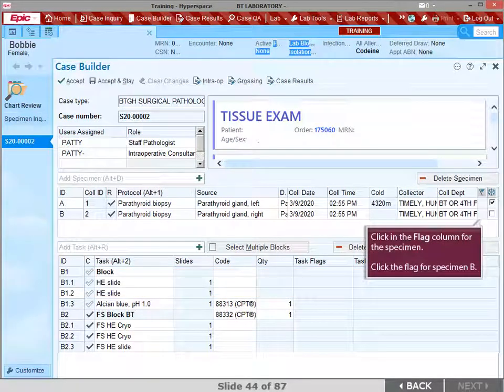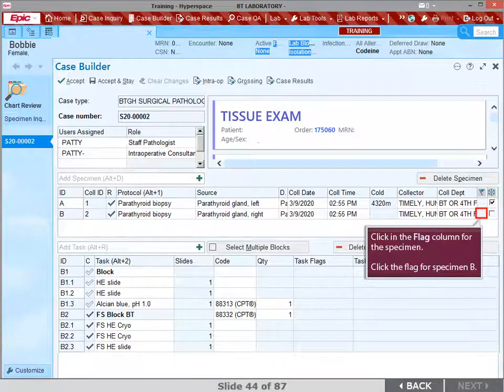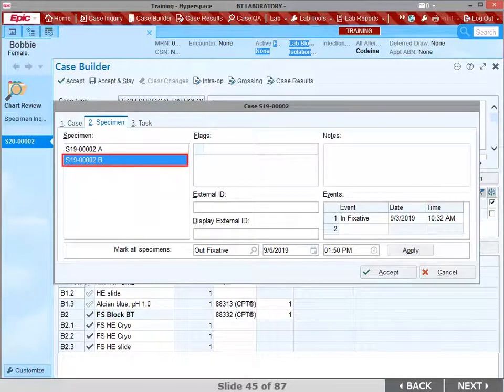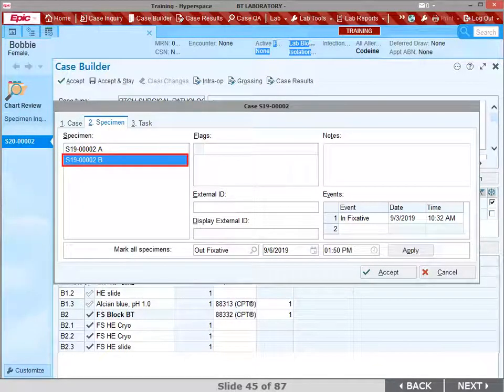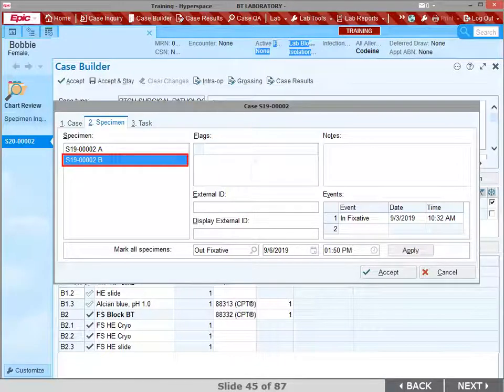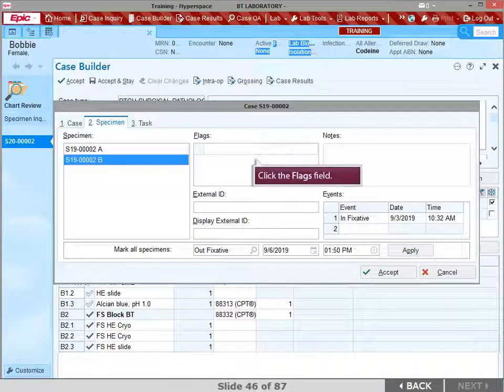To add a flag to a specimen, click in the Flag column. Click the flag for specimen B. The Case Info window opens. A flag may be added to a case, specimen, or a task. For this example, specimen B is highlighted for the flag. Click the Flags field.